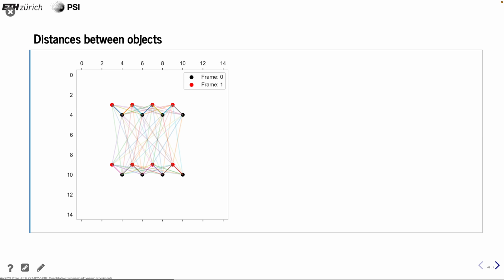In this case, it's actually a bit stupid because the distance is the same between all, or the motion distance is the same. So actually this point could have this and this as the nearest neighbor. Little flaw in the slide, but it could also actually happen in this ambiguity.